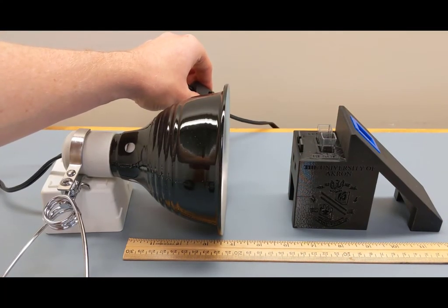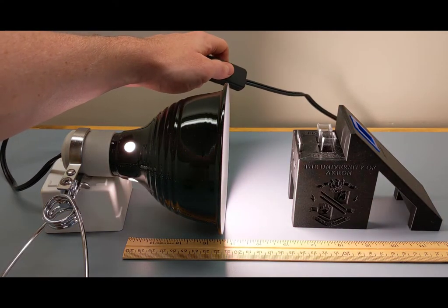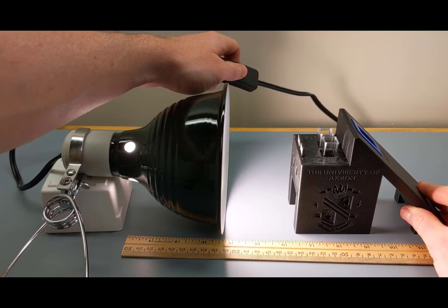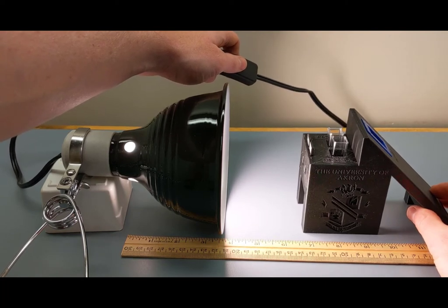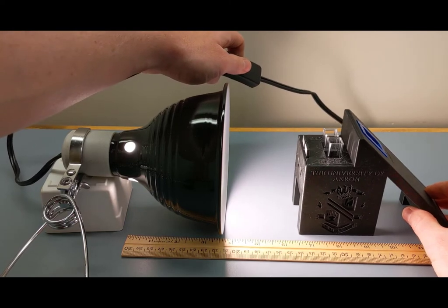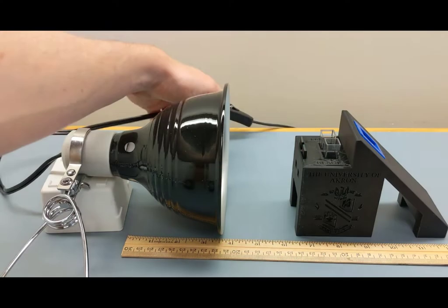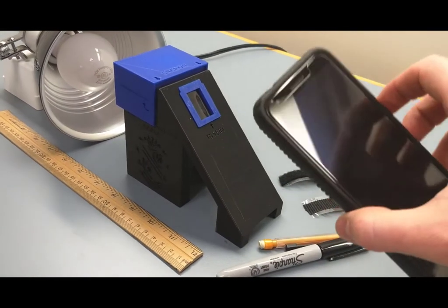To turn on your illumination source, flip the switch. You'll want to start with your spectrometer roughly two to three inches away from the light source, though that somewhat depends on your exact phone. Whatever produces the best spectral image on your particular phone sensor is where you want to position it. Two to three inches is a pretty good starting point for the phones tested.